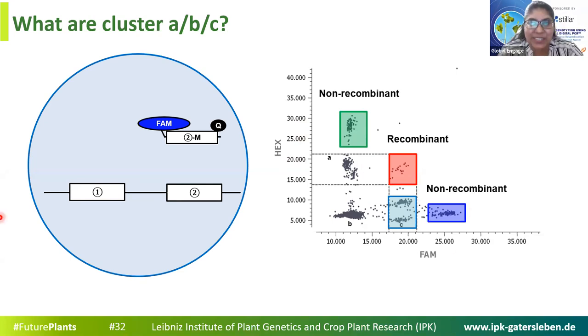Okay, thank you so much. Another question: what are the additional genotyping populations example in the figure on slide 13? Yeah, I think this is the same question. And I forgot to say, but cluster B are the droplets that had either no pollen nuclei encapsulated, like an empty droplet, or a droplet that had a nucleus, but for whatever reason, all the allelic probes didn't work at all. So they are the negatives, the B clusters.